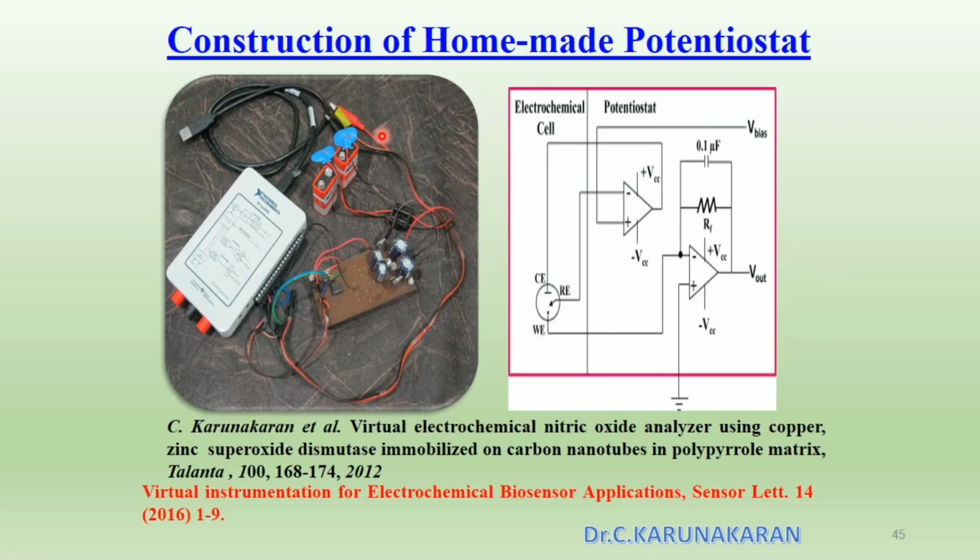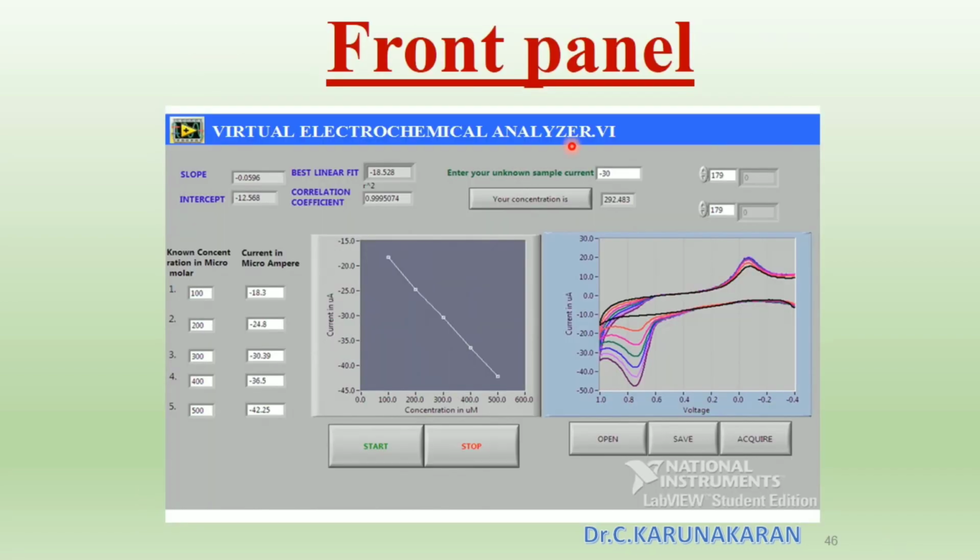This is the virtual electrochemical analyzer developed in our laboratory using the circuit diagram. This is the homemade potentiostat and this is the myDAQ supplied by NI instrument. The cost of this is 25,000. So we have developed virtual electrochemical instrumentation, electrochemical sensor for the cost of 25,000 only.